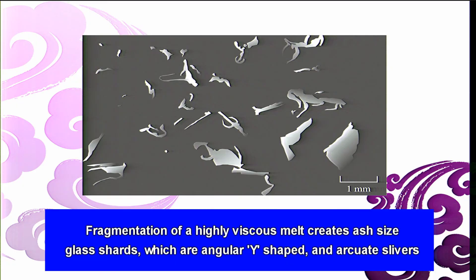You can see very sharp, pointed, needle-like, tear-shaped opaques — they are not crystals but glass shards. If you put a stone on a window glass, the glass breaks into small pieces. A similar mechanism occurs in volcanism: naturally formed volcanic glass, because of volcanic activity, is broken down and shattered into small pieces. These are known as glass shards.